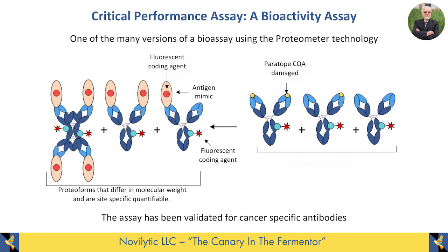Or you can imagine that both parts are defective. And how can you know that about a molecule, that your antibody is or is not defective? The way you can find that out is to actually take the antibody and give it to a patient and see if it's effective, see if it works.